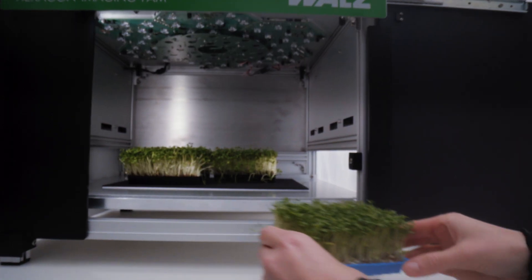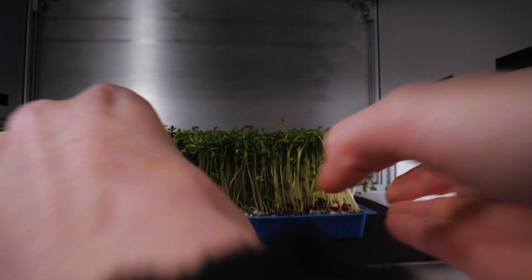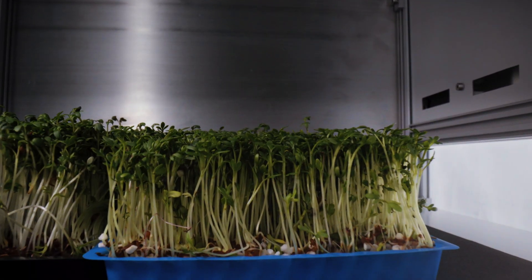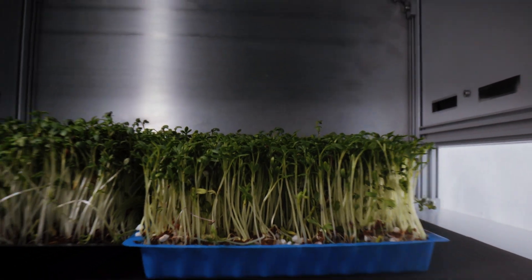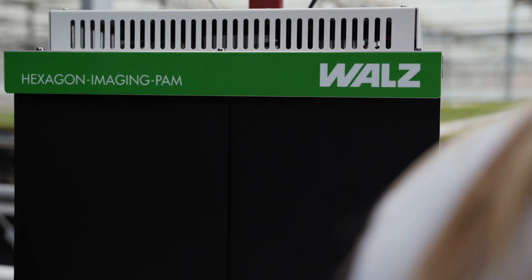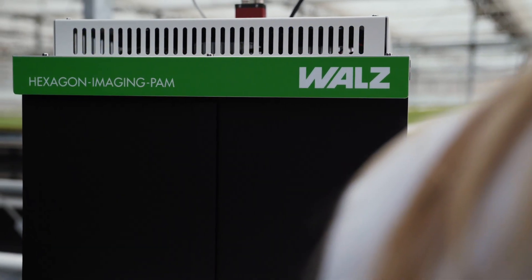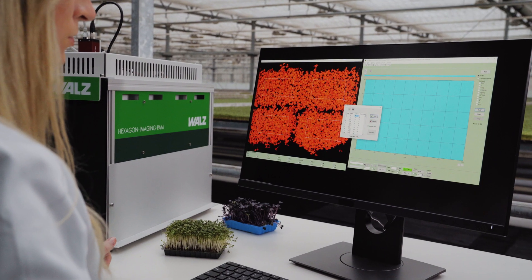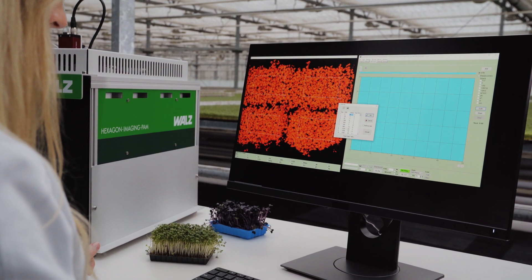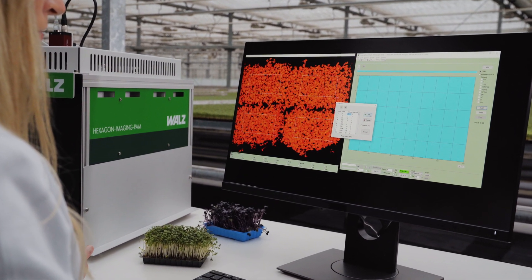By using the PAM technique, you can detect changes in Photosystem II fluorescence. Unlike conventional invasive methods, the use of PAM chlorophyll fluorescence is less labor and time intensive, and therefore particularly useful when experimental approaches need to be scaled up.